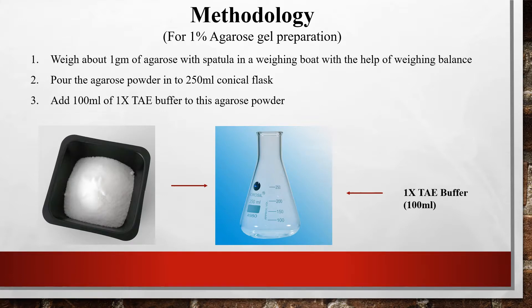Now let us see the exact method for preparing a one percent agarose gel. Weigh one gram of agarose with a spatula on a weighing board using a weighing balance. One gram is a very small, pinch-like amount. After measuring, pour the agarose powder into a 250 ml conical flask.